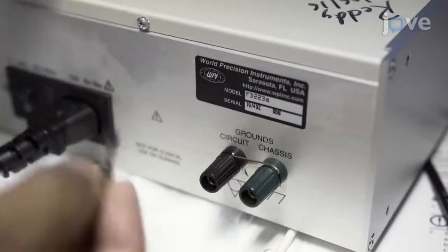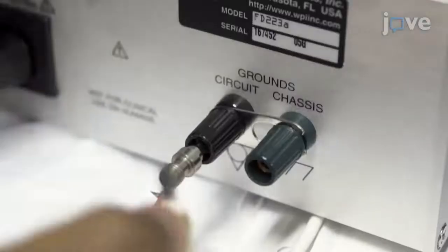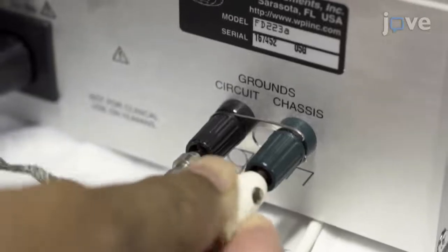Then connect the bath ground to the circuit ground of the amplifier with an appropriate electrode and ensure that the cage is grounded to the chassis of the amplifier.